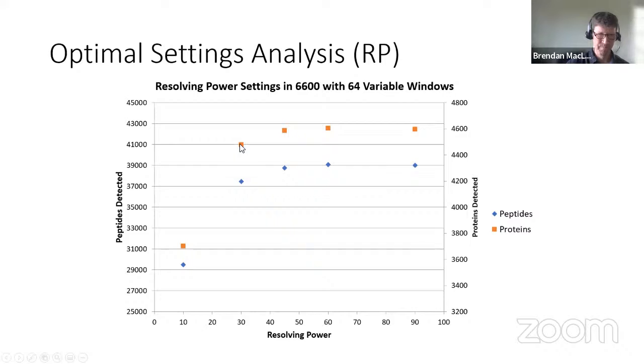And after talking to Pedro, I was like, oh, you should have used 30,000 resolving power. But then I wanted to do an exhaustive analysis where I was doing these 5 different resolving powers, and we actually had 4 different data sets. So that's 20 times I wanted to analyze these data in Skyline.